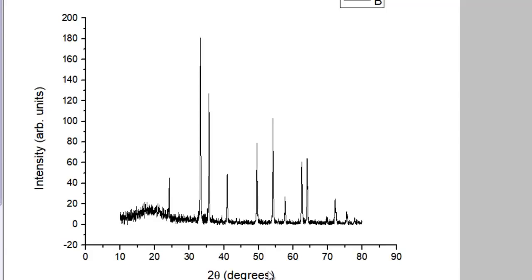Now the next thing you might want to do is get rid of all these labels or values, because intensity usually is measured in arbitrary units, as I already said. Basically the highest peak is scaled to 100 and all the other peaks are scaled relatively. So these don't offer any useful information, so you can click on either one of these and just press delete on your keyboard to get rid of them if you want to.